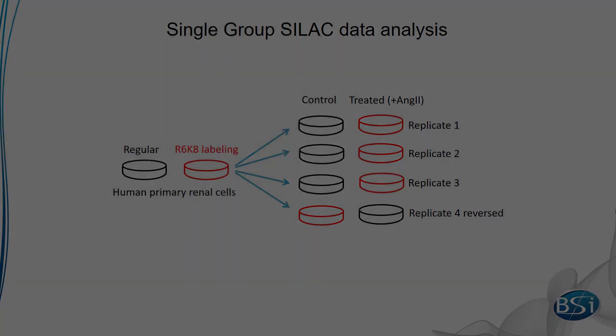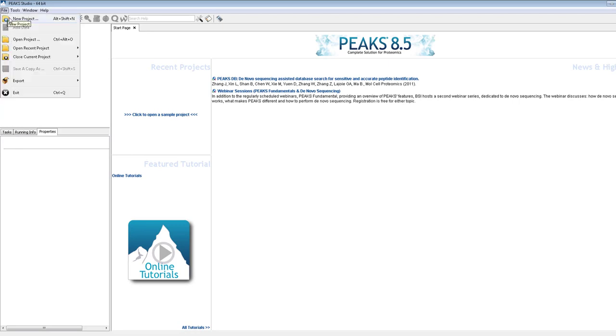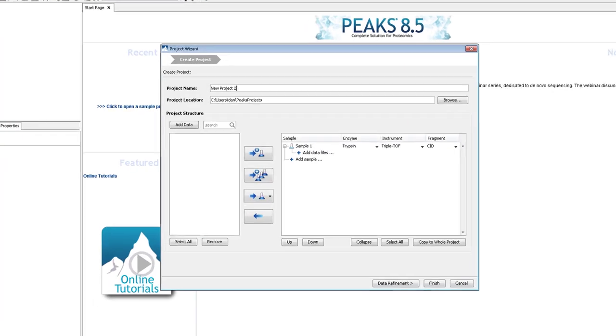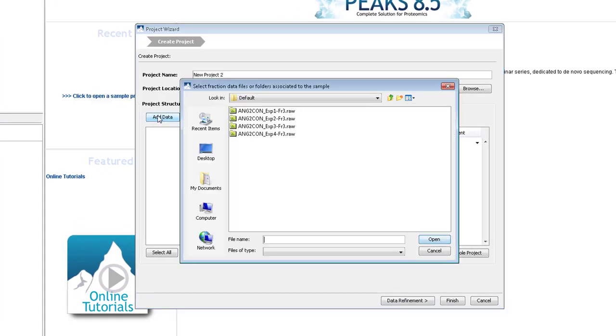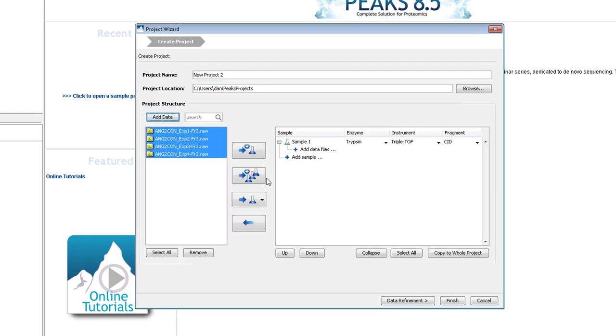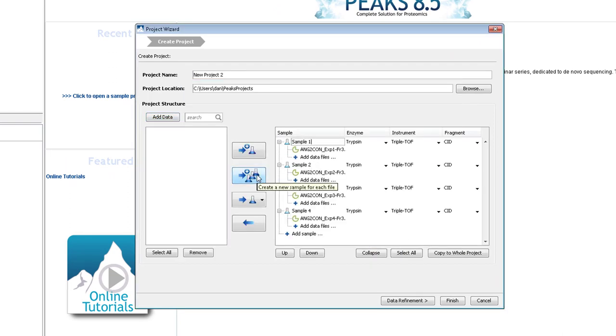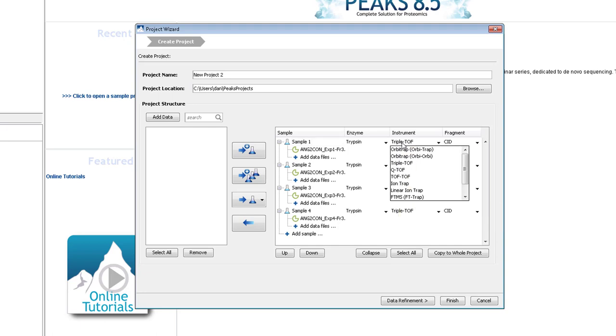This method can be set up in PEAKS easily. First, create a project by going to the top left corner of the screen and clicking the New Project button. Then, add the data from each replicate to a new sample as shown here. At this point, only the enzyme, instrument type, and fragmentation need to be given as parameters.